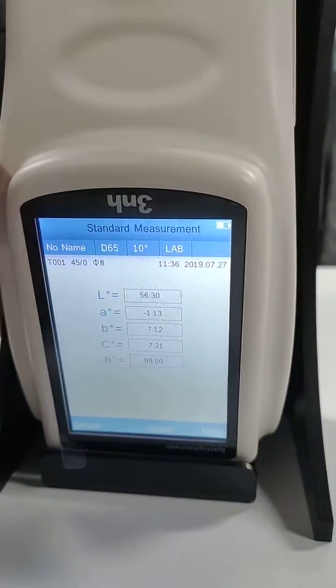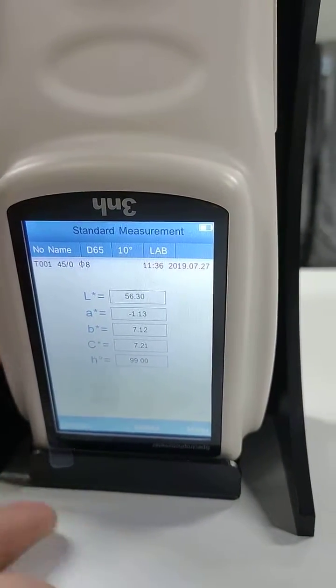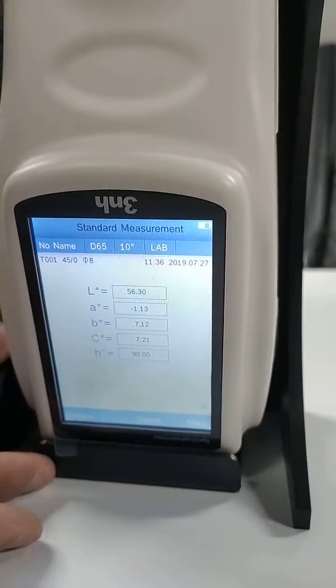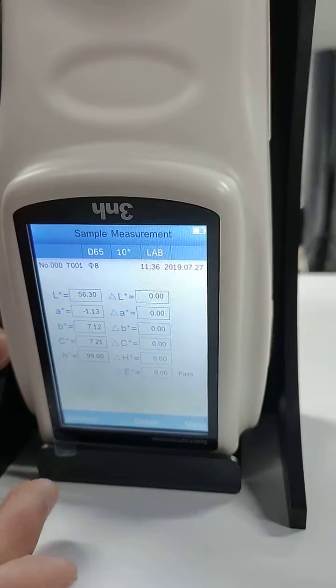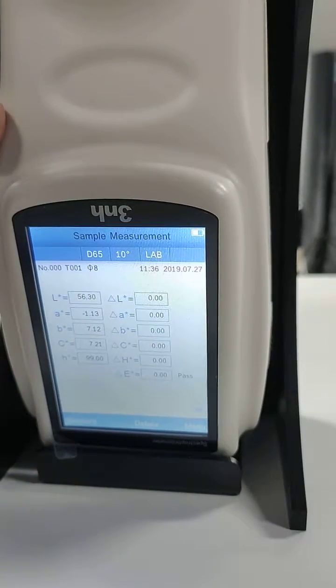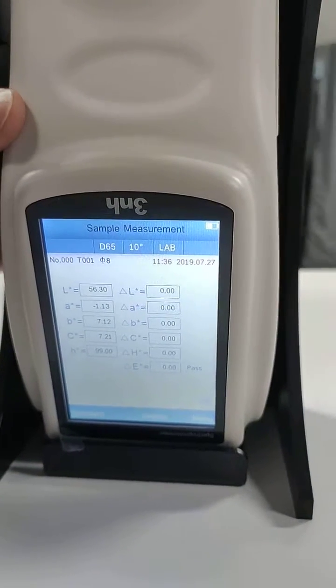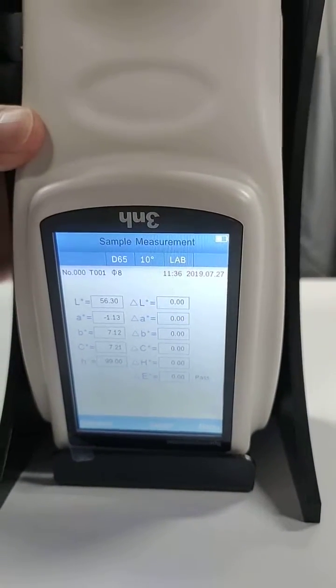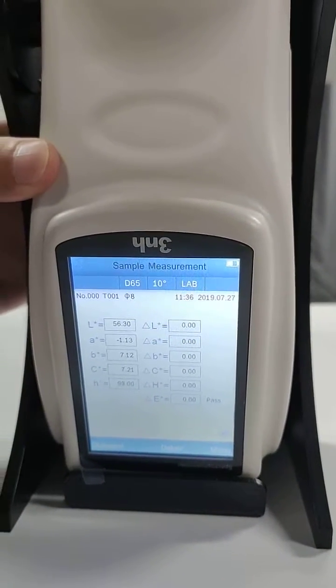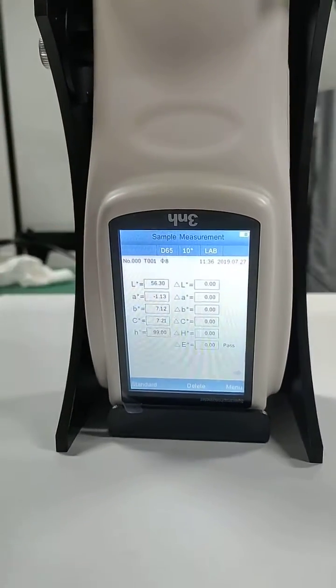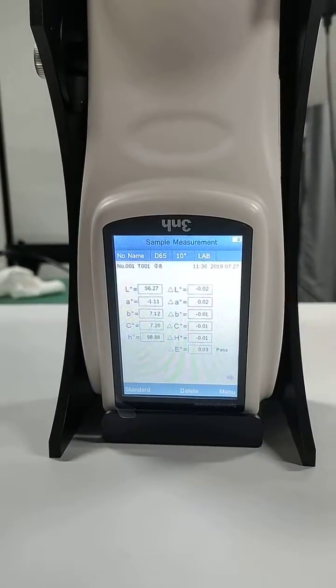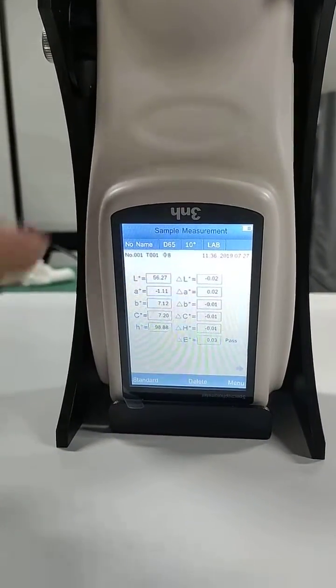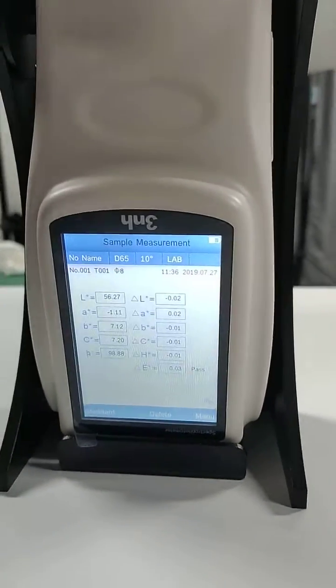Okay, we take a sample measurement. Okay, the measurement is done.